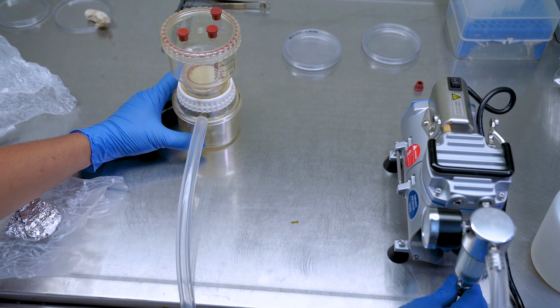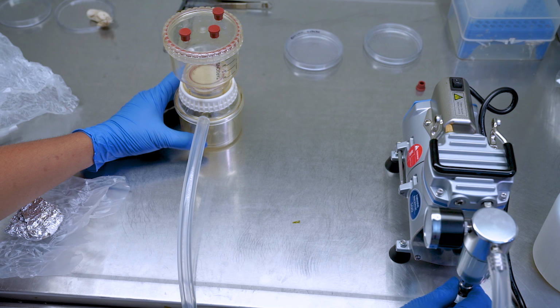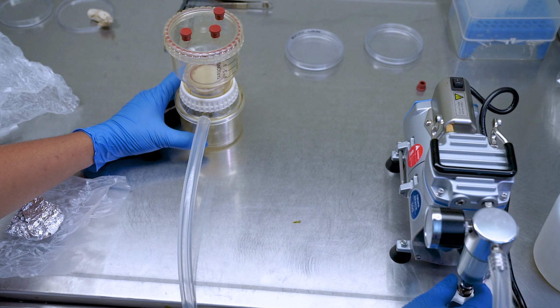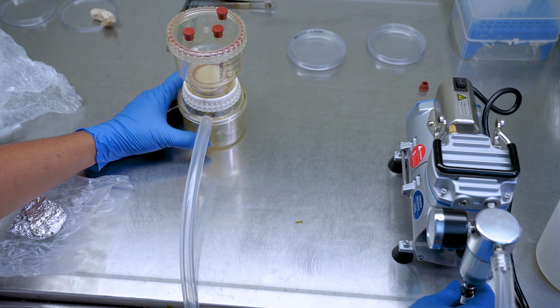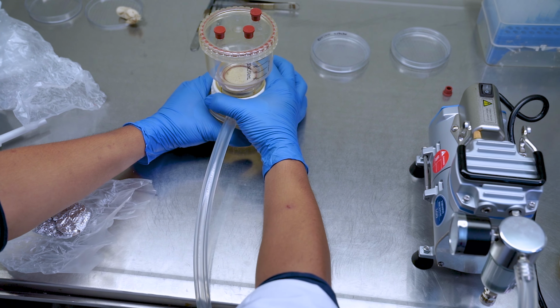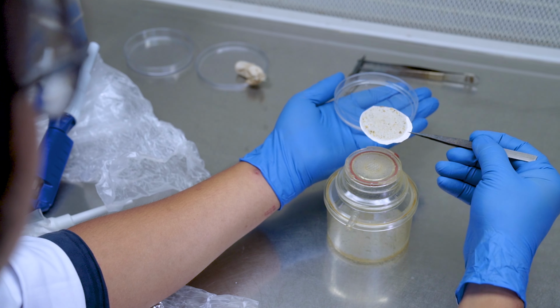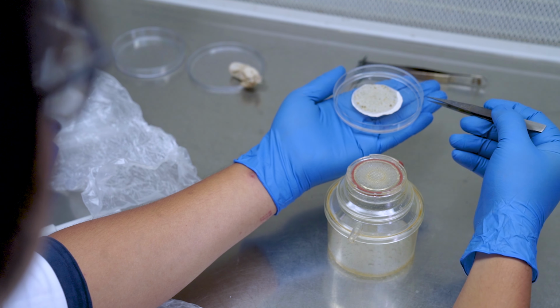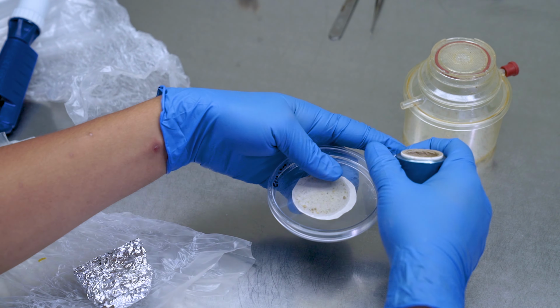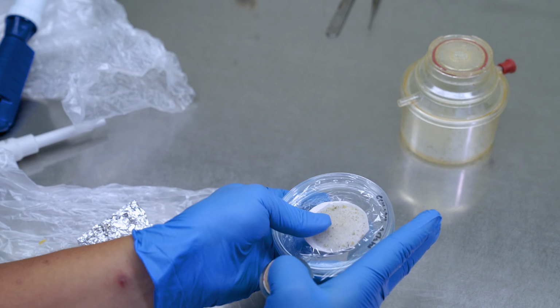In this way I can isolate and dry the embryogenic cells, and then I will put them on a co-cultivation media which has been supplemented with acetosyringone for around 2 days. Once the media is taken out, I will switch off the vacuum and transfer this filter paper to a co-cultivation media, and this plate will be kept in the dark for 2 days, 48 hours to be precise.